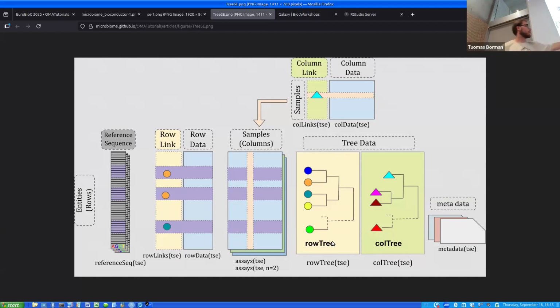So each row is usually an ASV or a strain. So usually for each strain you have the marker gene or sequence that is related to this specific strain. So then you can map these different sequences to that strain or row. Did that answer your question?